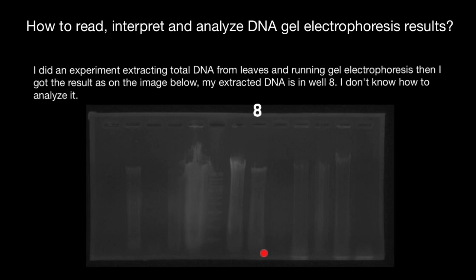Looking at the results of this gel electrophoresis, my first question would be whether this person used RNase. After treating a sample of the DNA with RNase, you might find a good quality and bright band of the DNA. But it looks like here we have a lot of contamination. We do see a band of interest, but also a lot of contamination of DNA or RNA, which is much smaller in size.